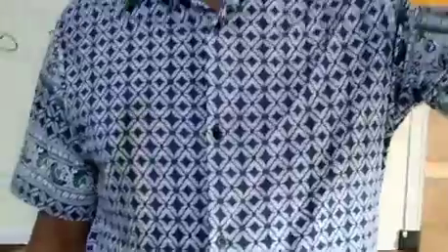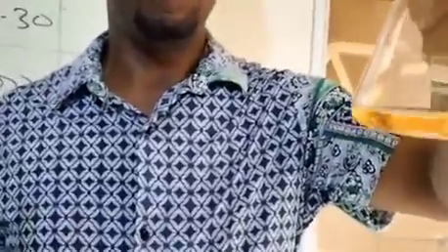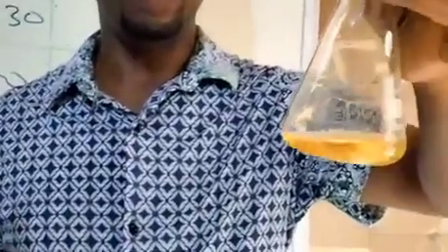Then, as we observe, 3 drops, 1, 2, 3, are added into this flask. So we shake it. As you can see, you have the yellow color of the methyl orange in the alkali.